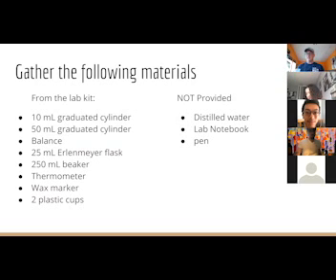And the other thing is, as Lance pointed out, if we look at the flask, it is not designed for measuring things. Because look, this 25 mil flask basically has two measurements on it, 25 and half of that, 12.5. So this is not a terribly precise instrument for measuring the volume of something. That's why we don't use it for measuring things. That's why we do reactions in this. We don't use it to measure things, like ever.